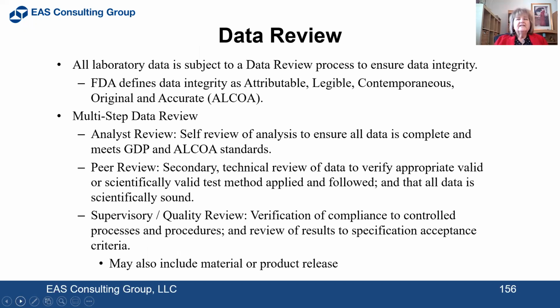All laboratory data is subject to data review process to ensure data integrity. Again, we're going to look at that multi-step data review. The analyst reviews their own work to make sure that everything is there and it's all complete.